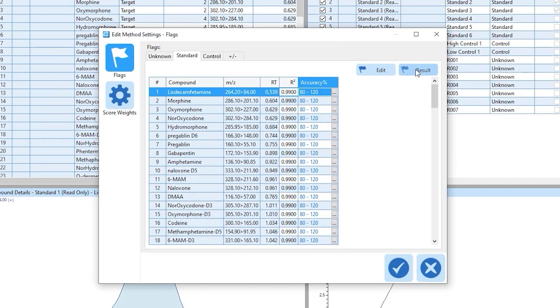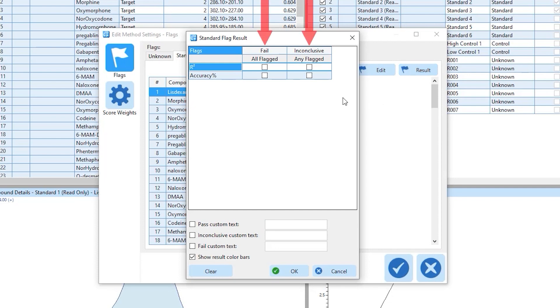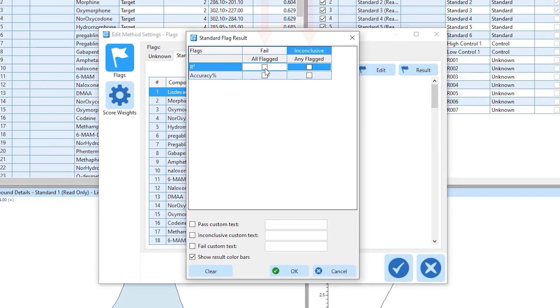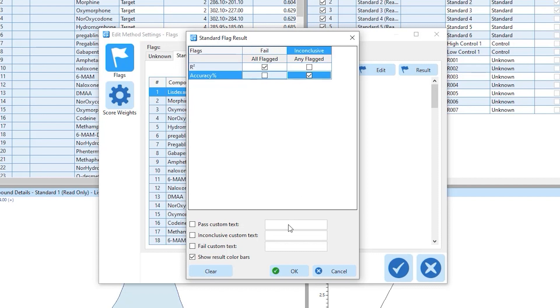Select the result to modify how the flags are reported. Flag parameters can be set to fail or be inconclusive if all the sample type or any type of sample is found outside of accepted values respectively. Custom text can also be set based on the flag result.